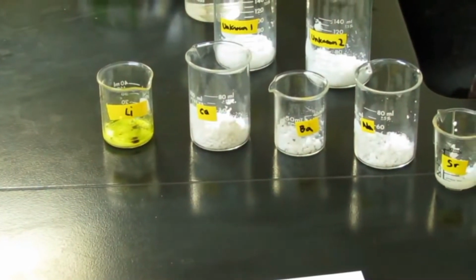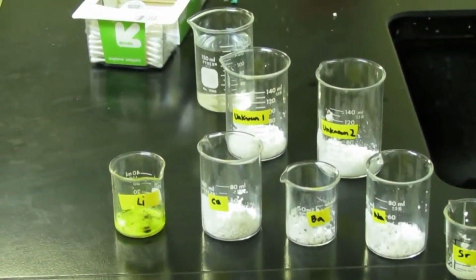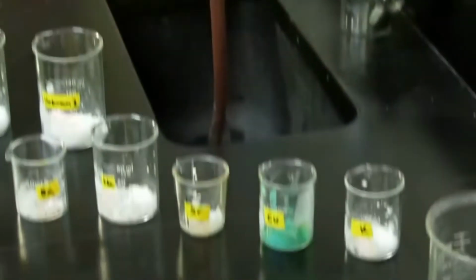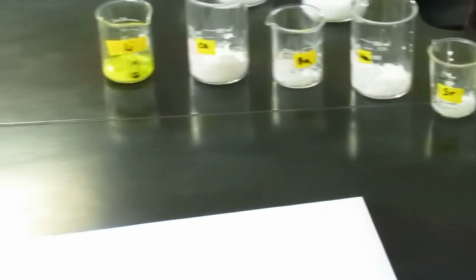We also have 2 unknowns sitting in the back there, and a beaker full of distilled water with some cotton swabs. And our waste container we'll be using as well. So let's get the burner flame in focus here, and let's go through the procedure.